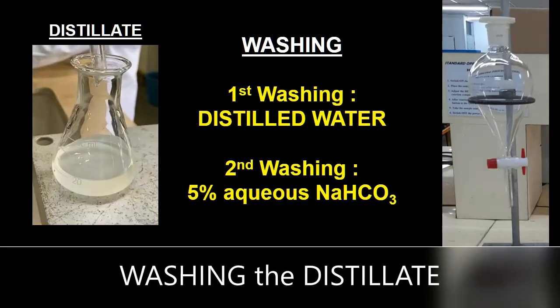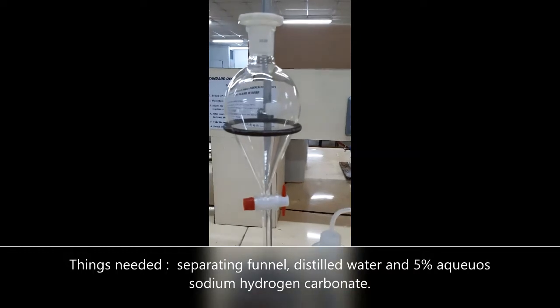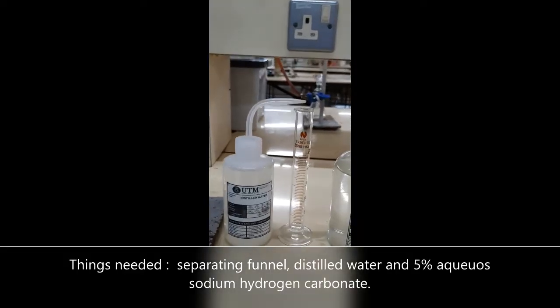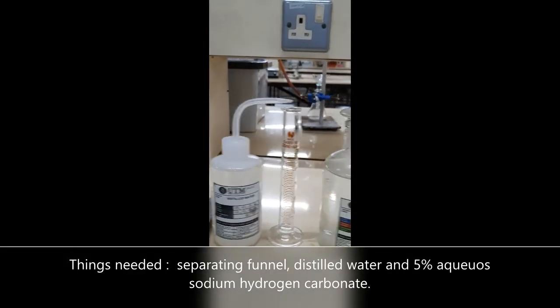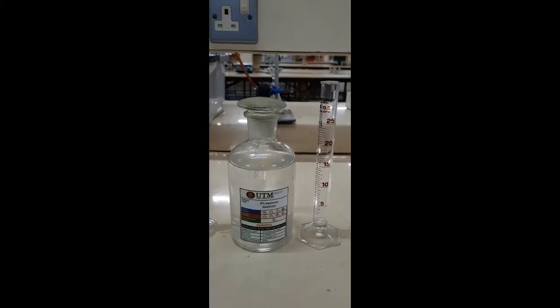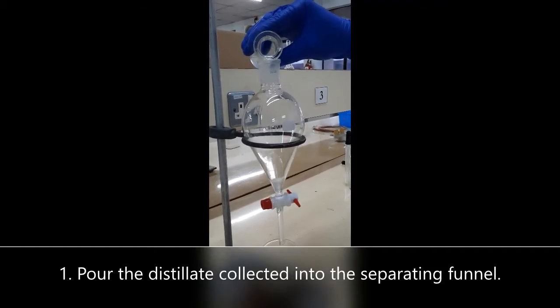The distillate undergoes a two-step washing process involving distilled water followed by a 5% sodium bicarbonate solution. A separating funnel is used in this step. Using a volumetric cylinder, measure the required volumes of distilled water and 5% sodium bicarbonate. Carefully pour the distillate into the separating funnel.